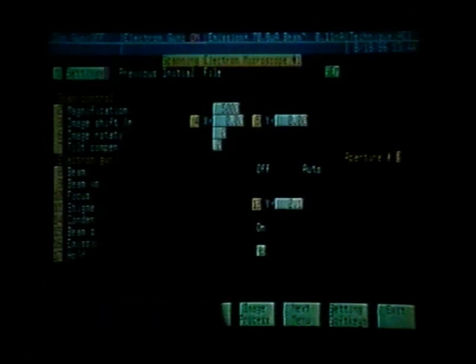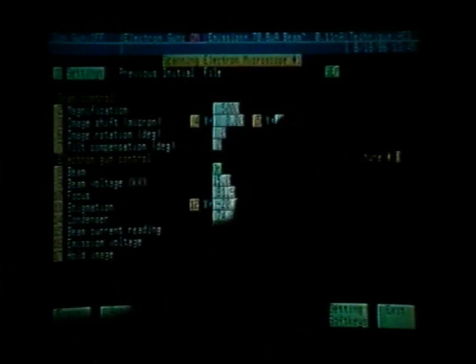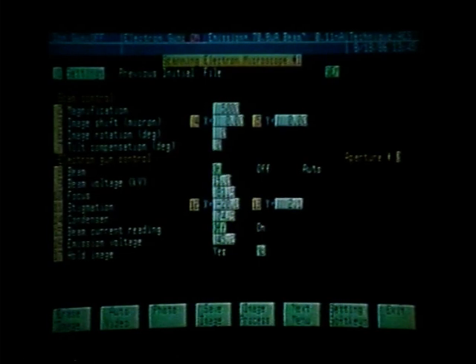If we were to now go to initial settings, which, if you remember, are at 3 kV, and we then introduced a new sample and wanted to take a secondary electron micrograph on that sample, we would have those settings already optimized under this file name, SEM. We'll be doing this also when we start Auger data. We'll want to get probably on this sample about 100 nanoamps of current, and once we get all of the electron gun parameters set for 100 nanoamps, we will then give another settings name, a user-defined setting, and we'll call that AES 100, which will give us Auger parameters 100 nanoamps.